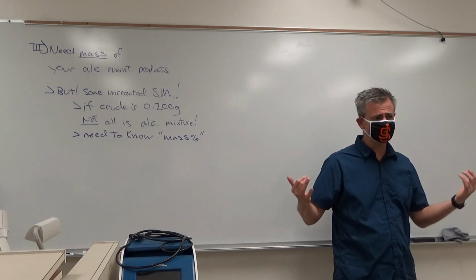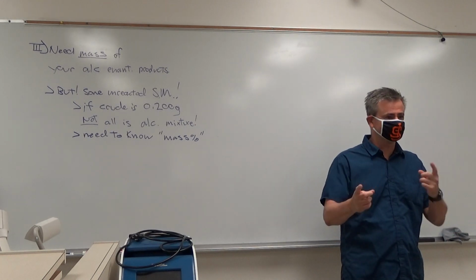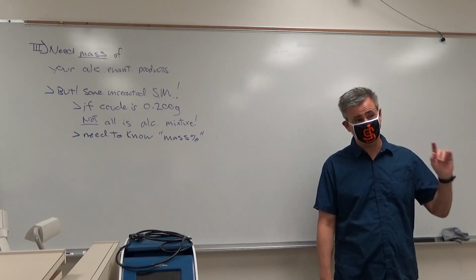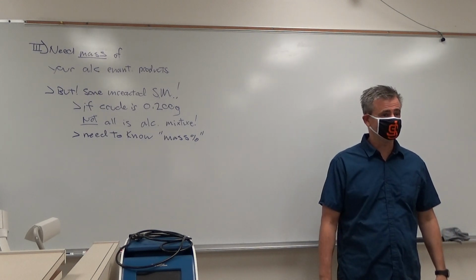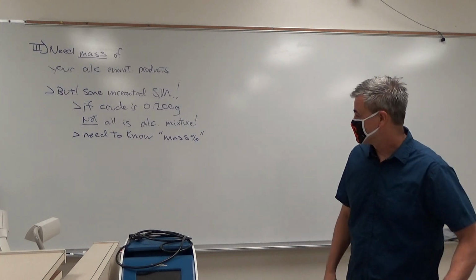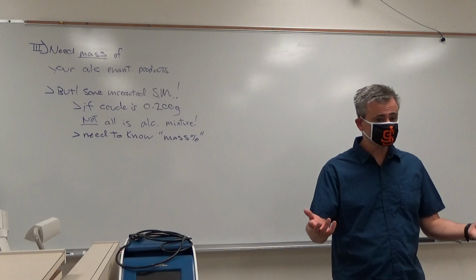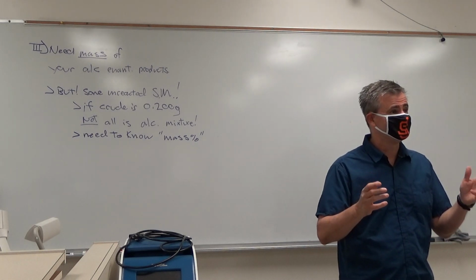If you just like, this looks too boring, I want to challenge. But, you know, I would compare CH2s to CH2s and CH2s to CH2s. And there's a hint in the worksheet of which ones you should choose. Okay. So you pick a CH2 to CH2 or methyl versus methyl, and then you compare their integrations.